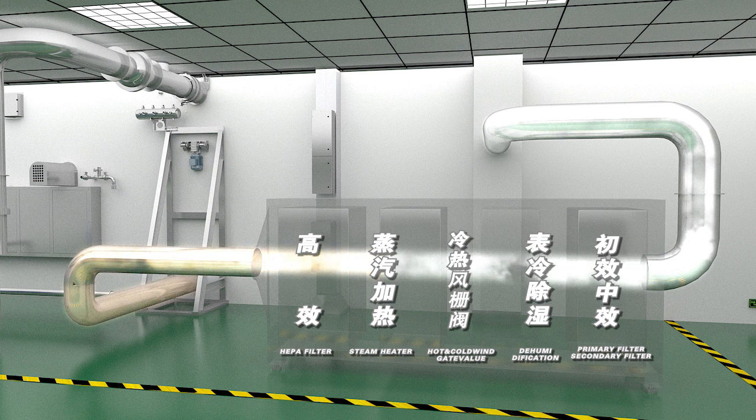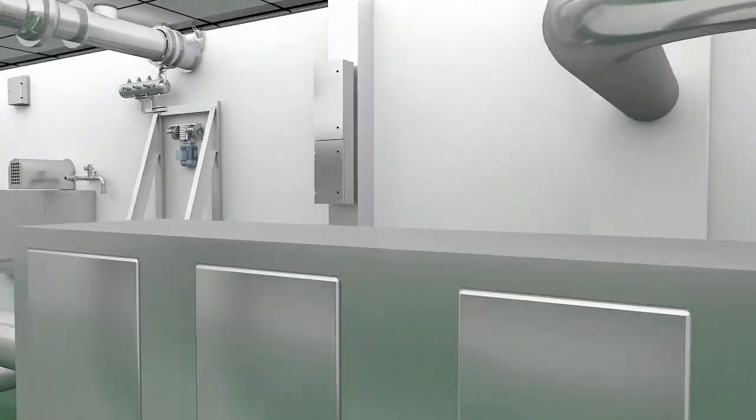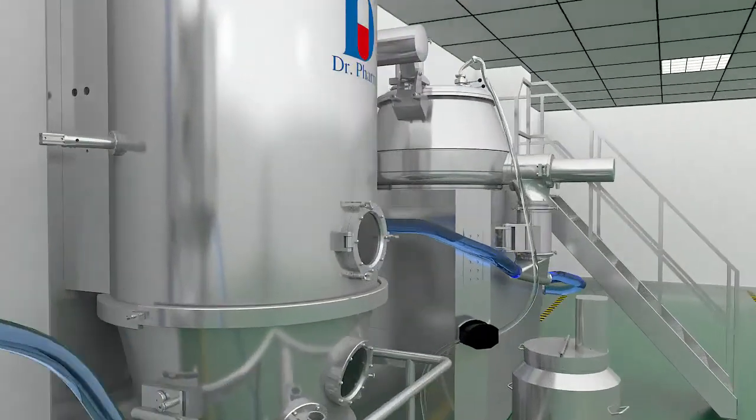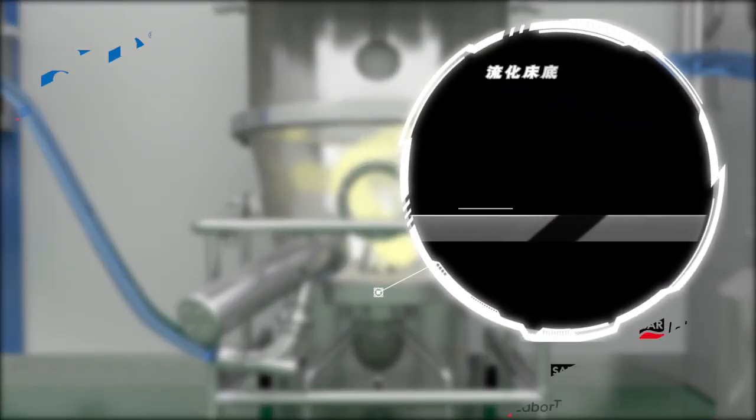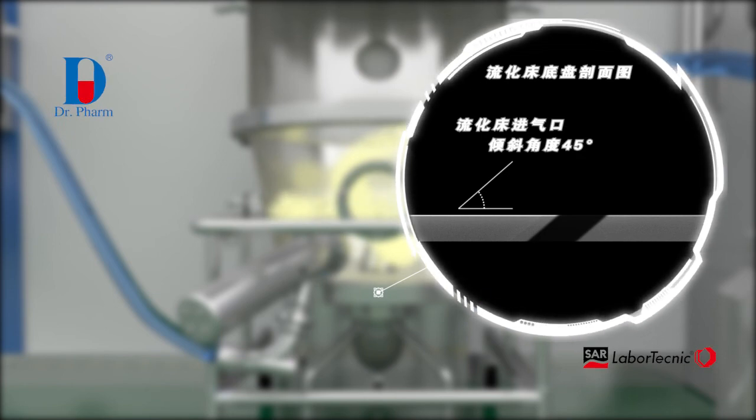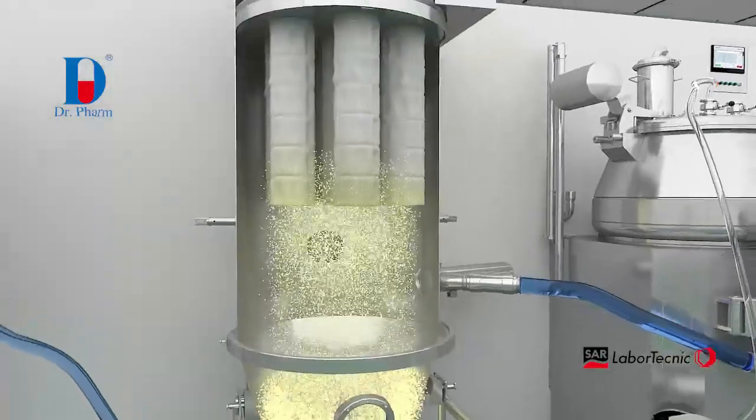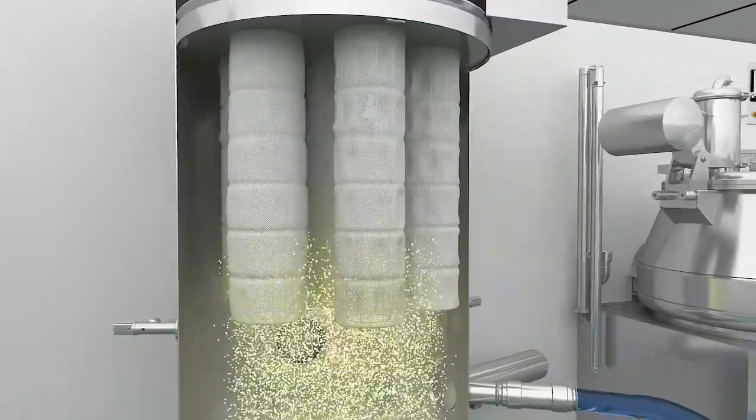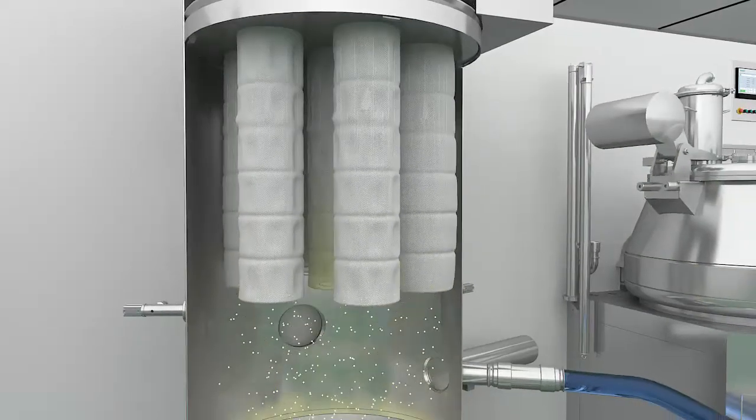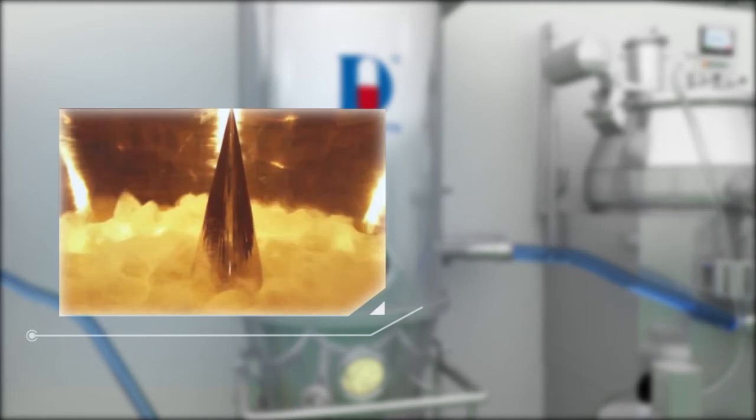The top chamber adopts automatic pulse jet de-dusting bag filter structure and the special design increases the filtration area by more than two times. The material container of fluid bed dryer adopts SS 316L 45-degree cutting tangential mesh plate to optimize the exchange between material and energy. The tangential air outlet has less stress on the filtering system inside of the top chamber and is easy to remove dust.